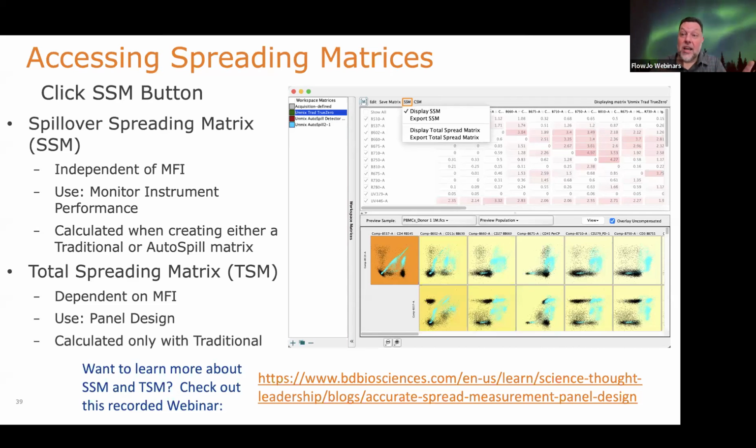Now, I don't have the slides to articulate this at all, but I do have a very good webinar from BD Biosciences, from Mirko Corselli, on total spread measurements and the difference and the application of these two spread measurements on flow data. And it's about an hour long. You can find it at the BD Biosciences website. Need to get a link, email FlowJo@bd.com and we'll send it to you. If you just search for spread measurements in BD Biosciences or total spreading matrix, you'll find it as one of the top hits on Google.